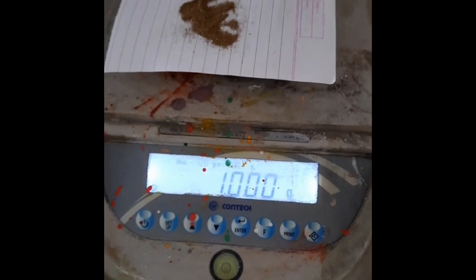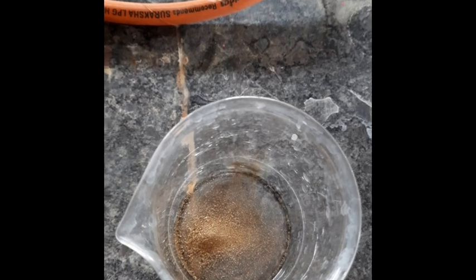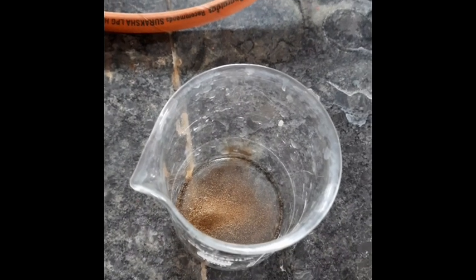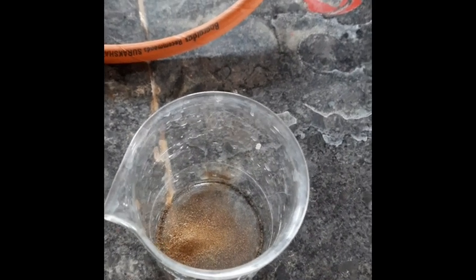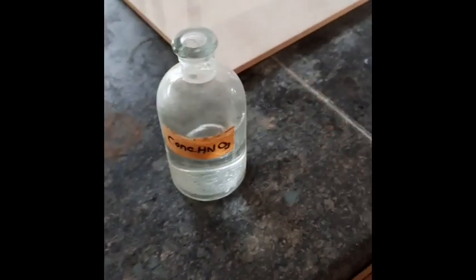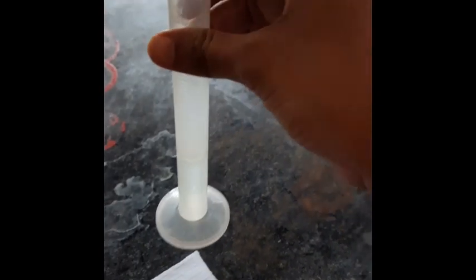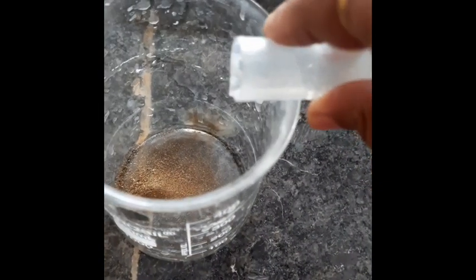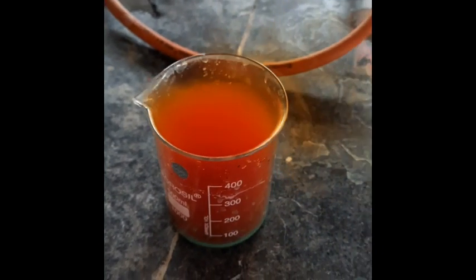Now what you have to do? You have to transfer this 1 gram of copper ore into the 250 ml beaker. Now, in that, you have to add 10 ml concentrated nitric acid. This is the concentrated nitric acid, it is written here. Using a measuring cylinder, I have taken 10 ml and now I am going to transfer it to this 250 ml beaker. Brown fumes are evolved here.